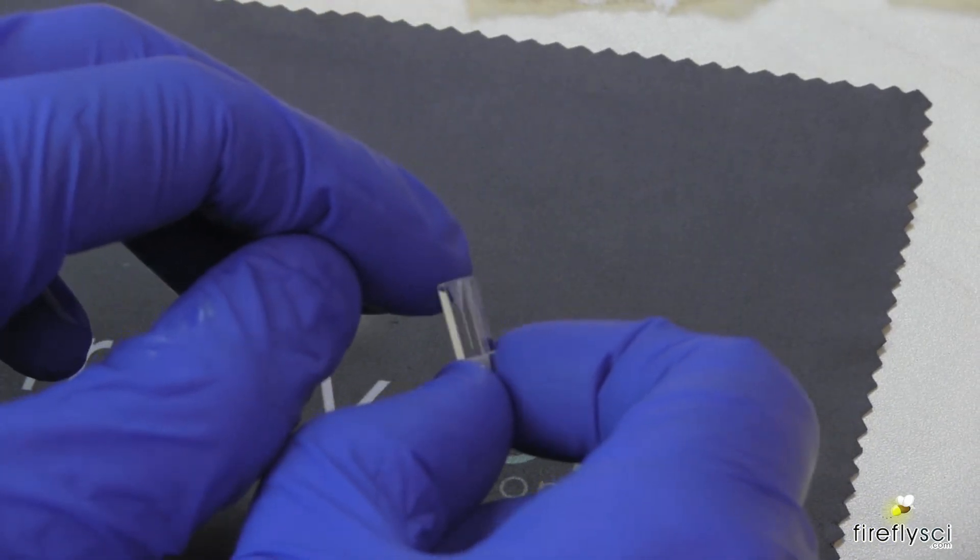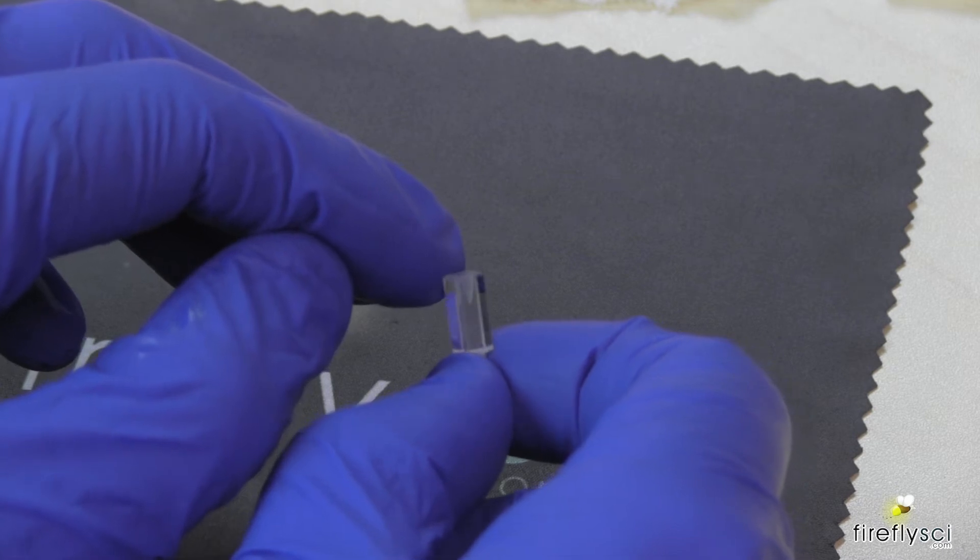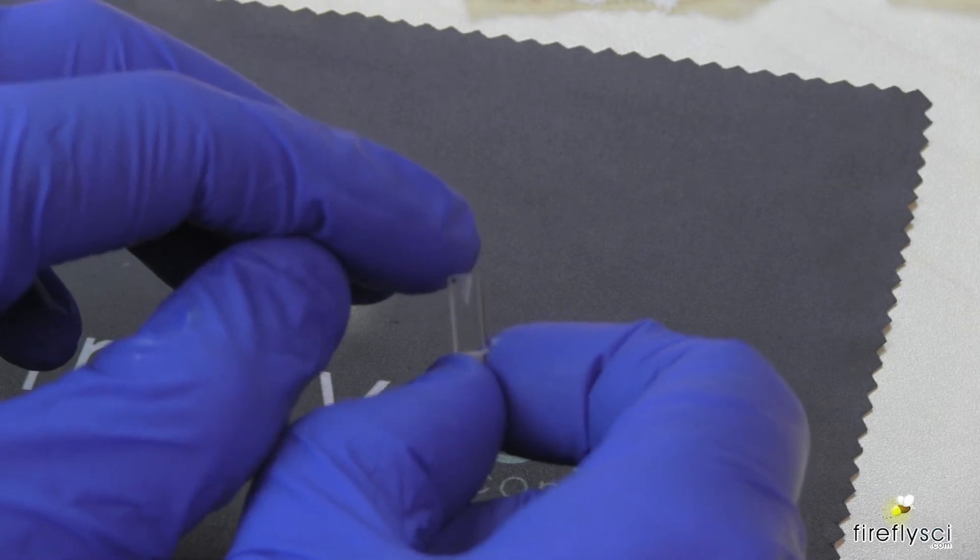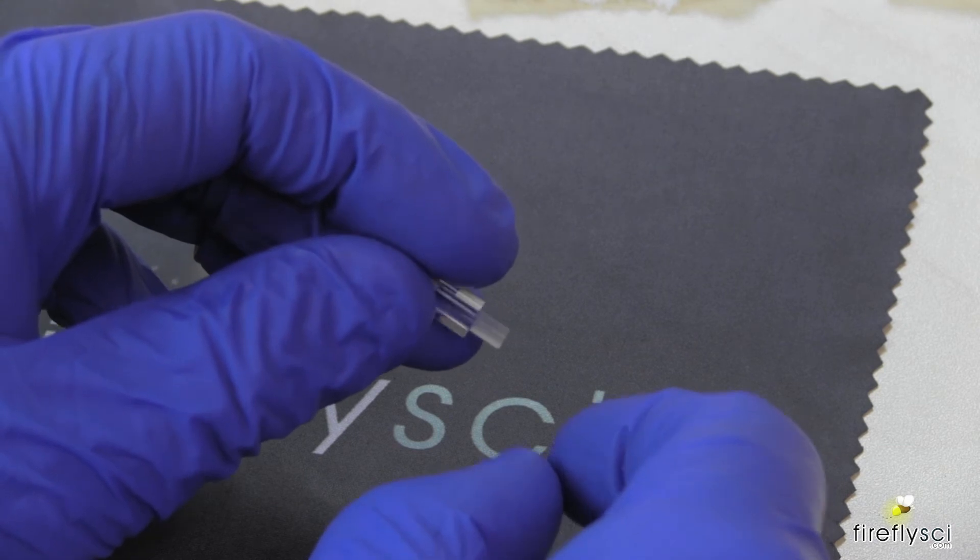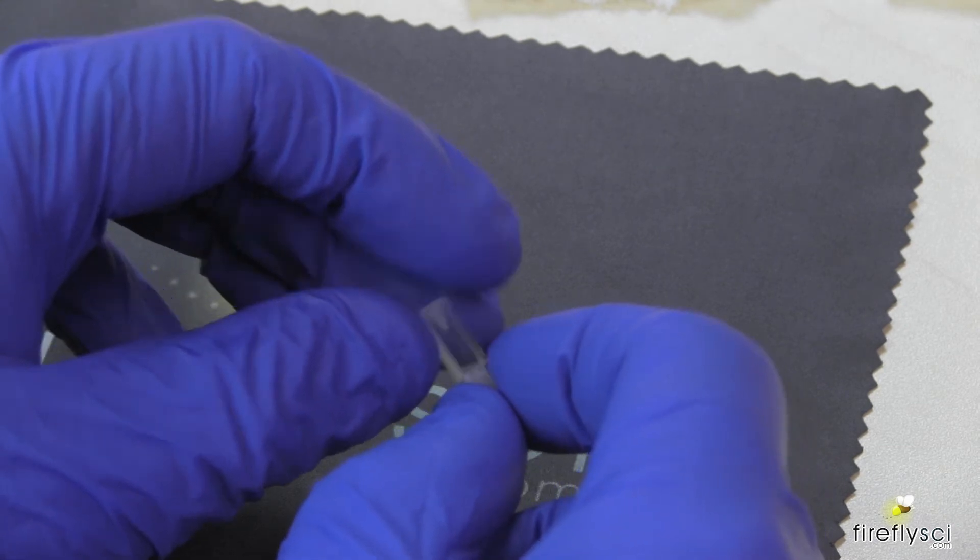This one here has an inlet cone right on the top. It also has a special adapter here for easily pushing on tubing on the bottom.